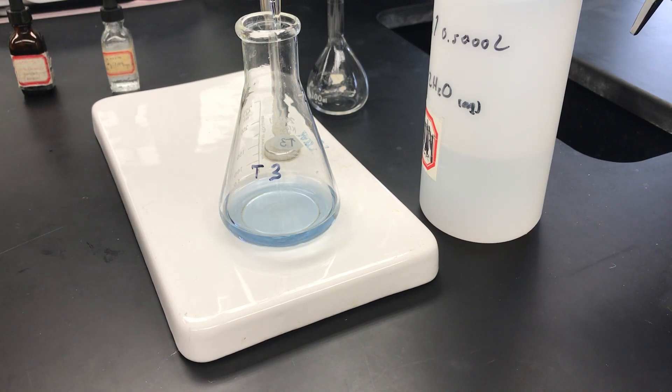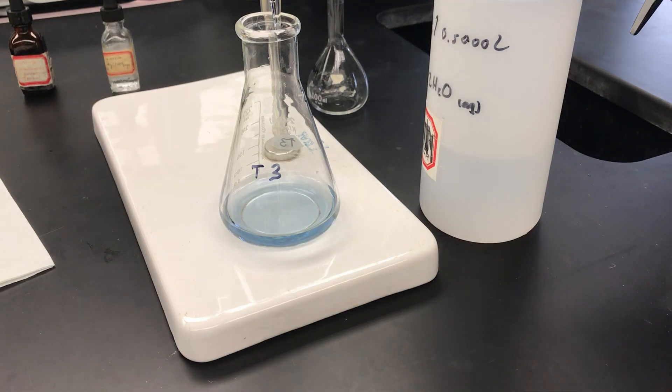I'm going to get that last burette reading and it looks like I'm at 16.20 exactly. I've recorded that value. At this point, this is what the titration looks like. I'm going to end up feeding you data for all four of the titrations I did so that we can then work them up — that's something to do for another class period. Thank you.